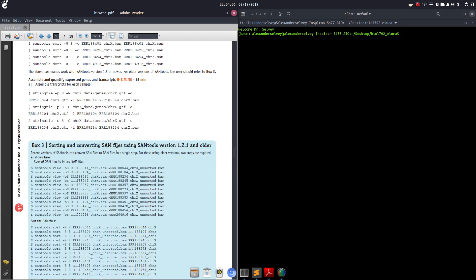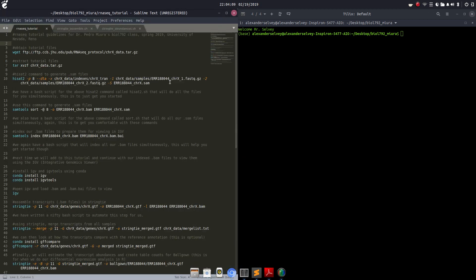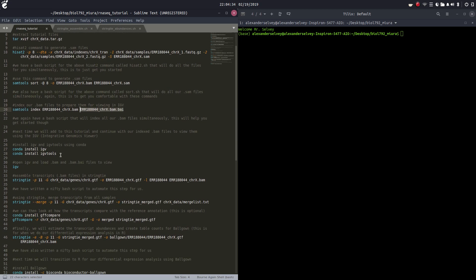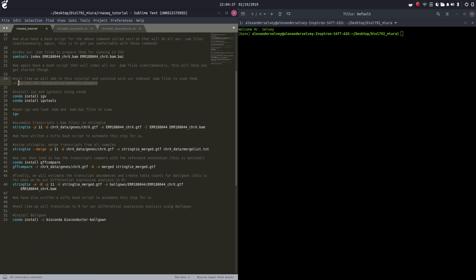Just a brief recap: we used this piece of code to obtain our files, this piece of code extracts all of our files, we ran HiSat, we sorted our SAM files and created BAM files, we indexed our BAM files so that we could get BAM.BAI index files. We will start here - next time we'll add to this tutorial and continue with our indexed BAM files to view them in the Integrative Genomics Viewer.